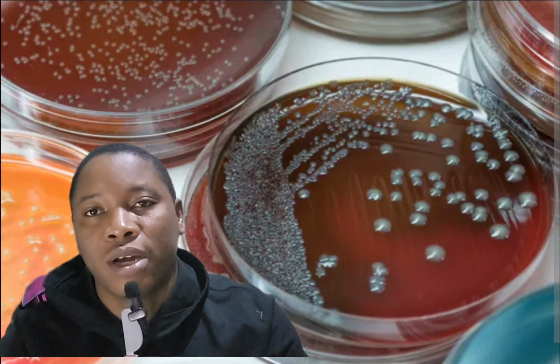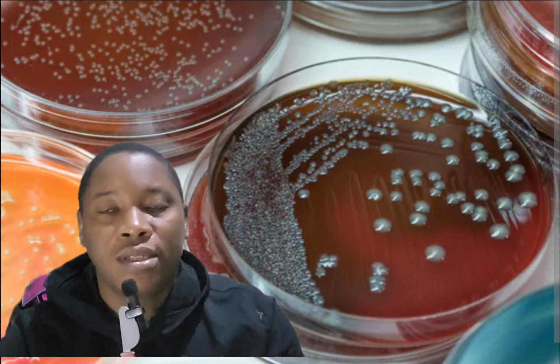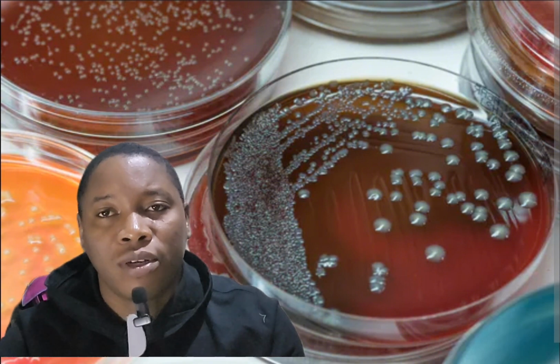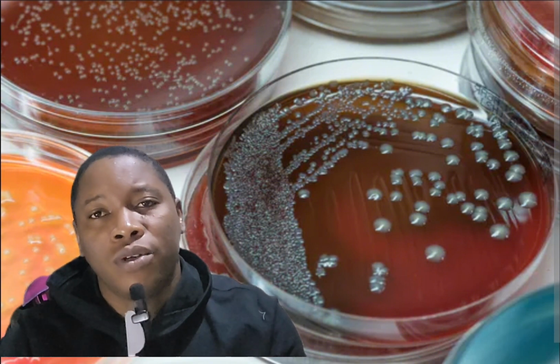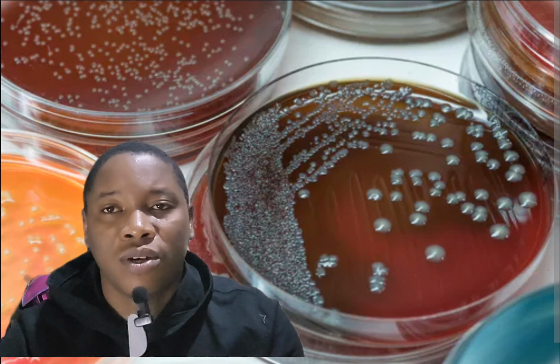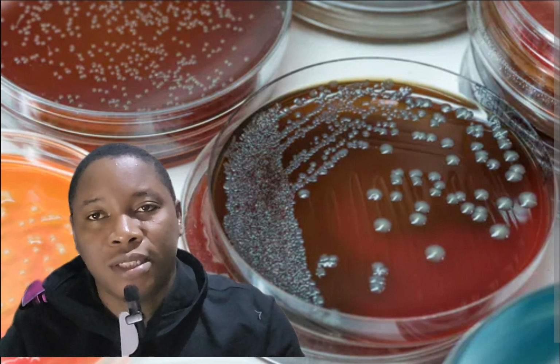Today, we're going to do a longer video where we just talk about culture-based techniques. Now, it's important in microbiology that we're able to grow microorganisms in the laboratory. We're going to make this a series where we'll be talking about different methods of culturing microorganisms and how we can run it in the laboratory.